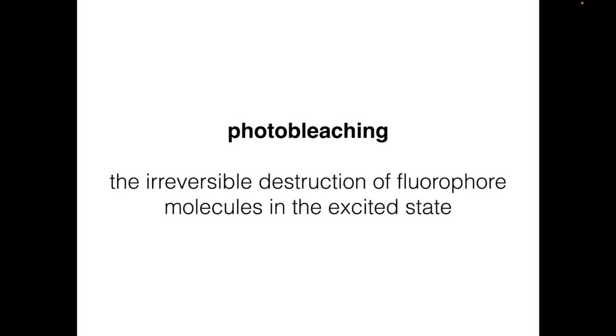When a fluorophore molecule is excited, we want it to undergo the process of fluorescence — that is, to emit a photon and drop back to the ground state. However, this doesn't always happen. Whenever the fluorophore is in the excited state, there is some probability that it will undergo a reaction that destroys the fluorophore. This is called photobleaching, defined as the irreversible destruction of fluorophore molecules when they are in the excited state.